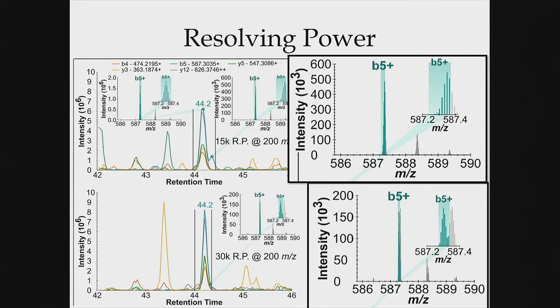I also should have shown the example, but one thing that I've been starting to see, which is kind of terrifying, is you'll see these transitions that coelute really well with your peptide, but they're actually noise. So they'll coelute well, and you need to look and see what the mass error is, which is something Skyline will also show you, to be sure that they are in fact true transitions. What I'm saying is that looking at just the elution profile, while it works most of the time, it's not always the case that just because it coelutes, it's not interference. Any questions?